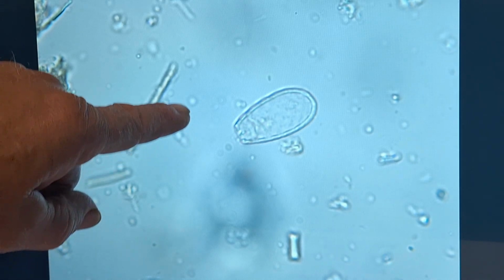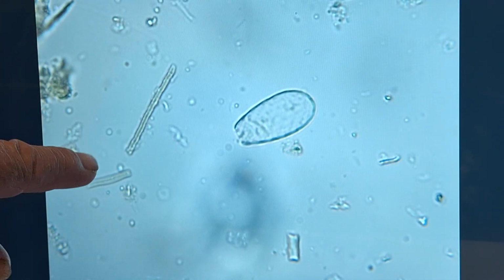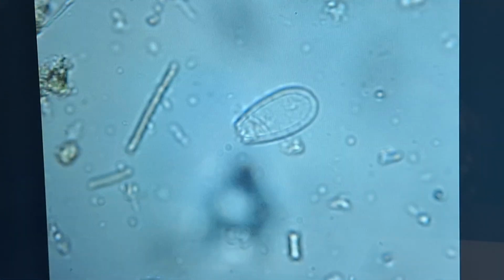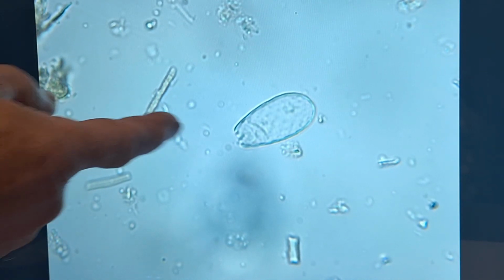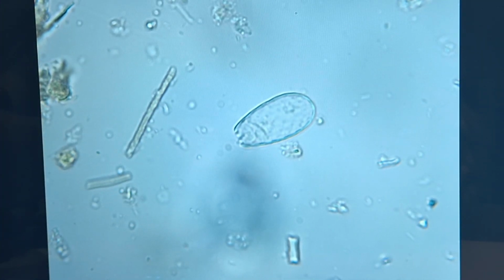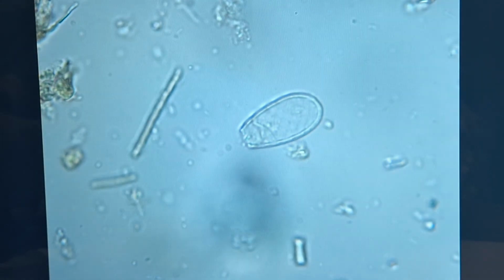So there's a real good look at a shelled amoeba, testate amoeba. We see the mouth on this end. As I go through the layers here, we'll see the insides a little bit. Let me see if I can change the color and get a better look. That's the best I can do right there. We're getting a good idea. You can see the mouth on this end, the shell around it. We'll find a few more, I believe, while we're in here. Sometimes you can even see the bacteria or whatever's been eating in the inside of it.